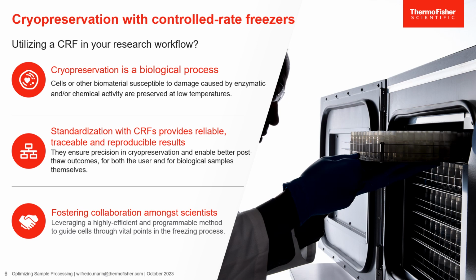When we use a control rate freezer, it provides an incredibly reliable, traceable, and reproducible set of results. This data can be captured in several forms, but the goal is to ensure precision in cryopreservation and enable better post-thaw outcomes for both the user or the samples that you're working with.